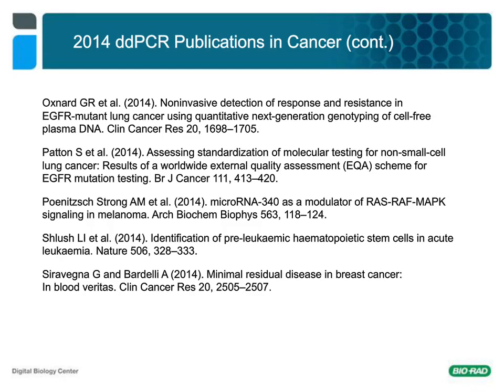That being said, there are creative assay formats, where, for instance, the Oxnard paper performed a deletion assay, we call it a drop-off assay, where you have a probe directed towards a specific wild-type sequence, and if some unknown mutation or deletion under that site occurs, then the probe will drop off. Based on the quantification, you can tell there is a mutation there, and you don't necessarily know which one it would be.